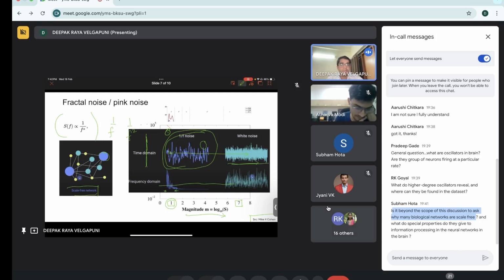But these later frequencies actually are used in longer time scales. So for example, if you're doing some aging research, in those cases 1/f noise becomes more important, because there is a paper I can share later.